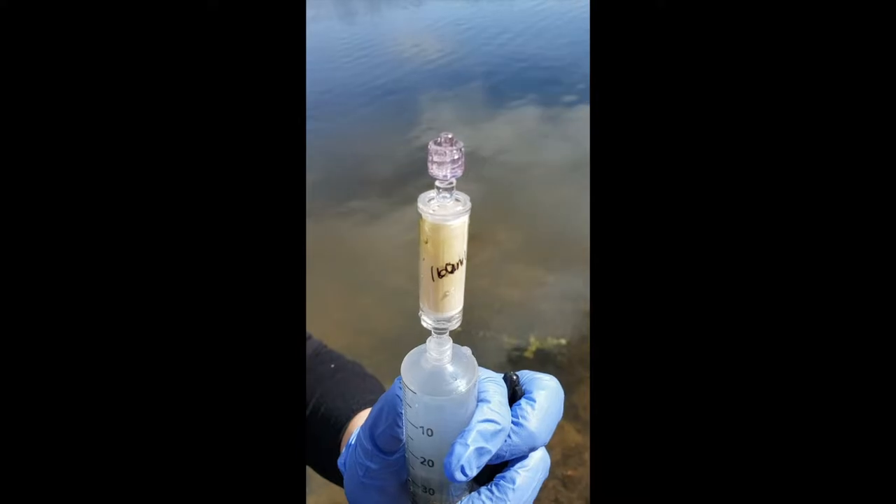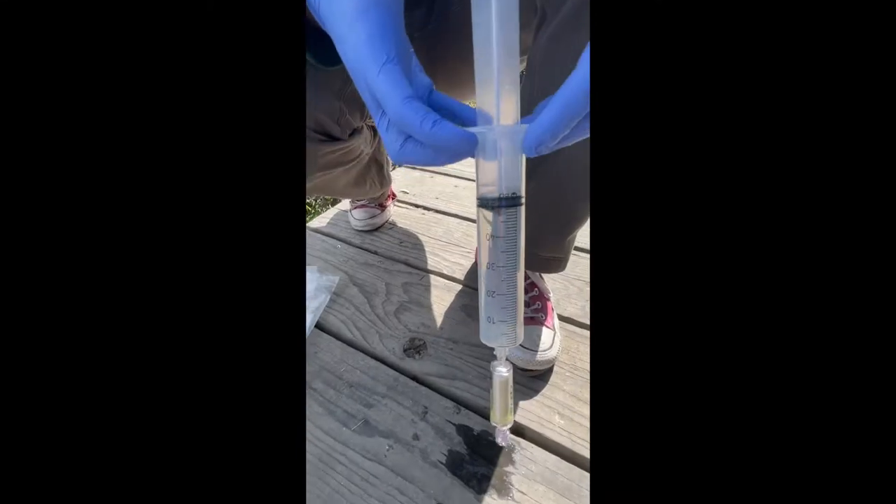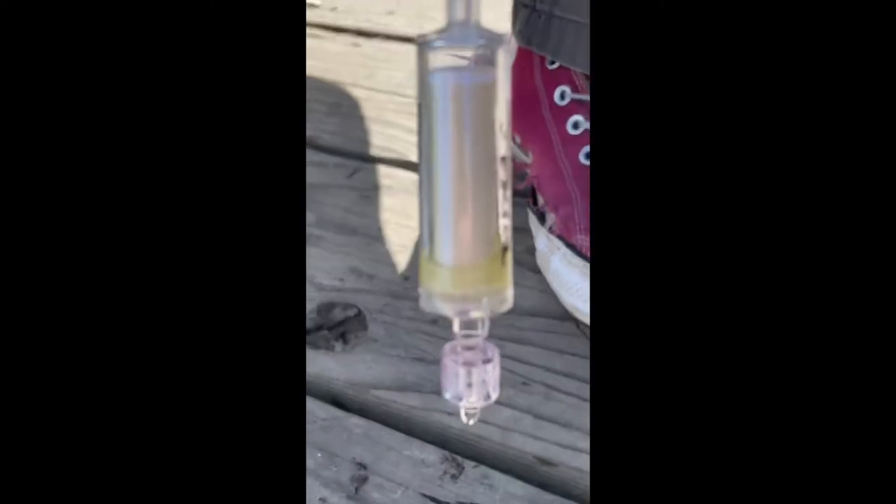Then mark the filter with the amount of water pushed through. Finally, draw up a volume of air to flush the filter of any remaining liquid.